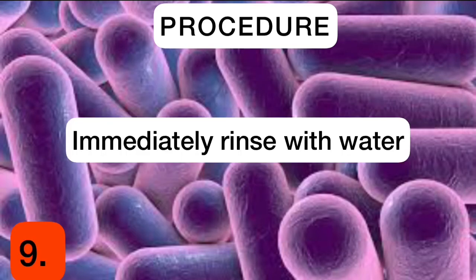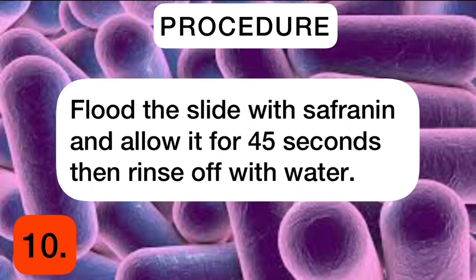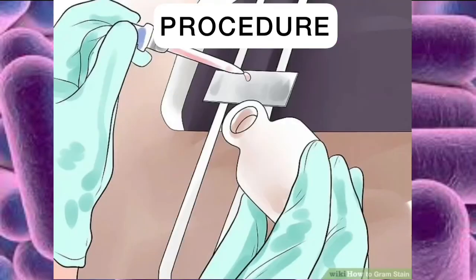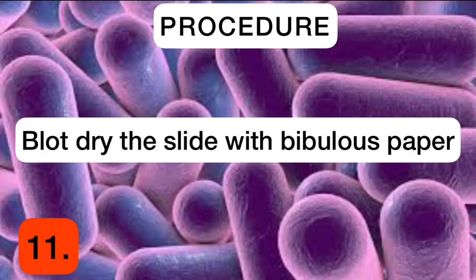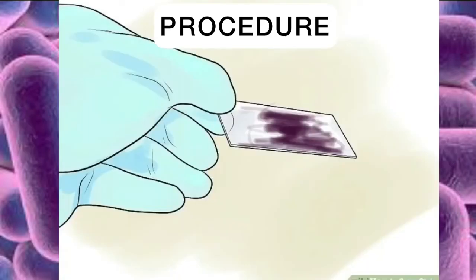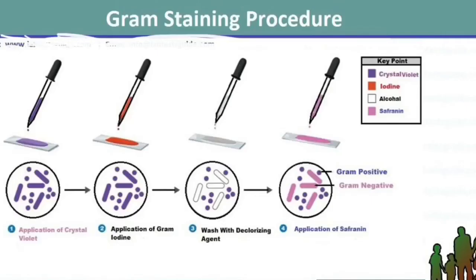Immediately rinse with water. Flood the slide with safranin and allow it to stand for 45 seconds, then rinse off with water. Blot dry the slide with blotting paper. The slide can now be viewed under the microscope using oil immersion.